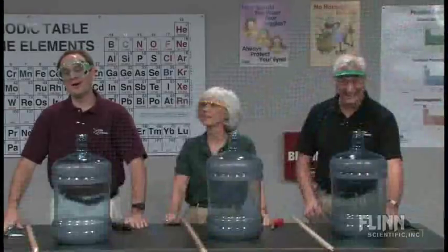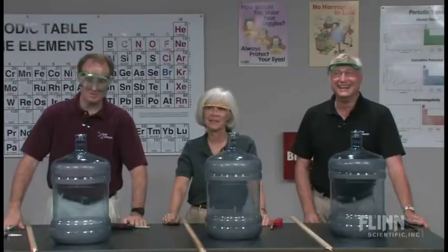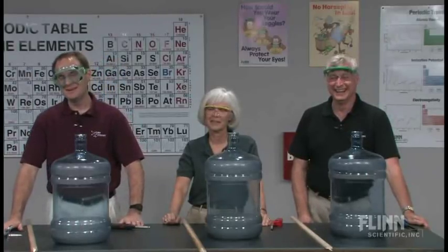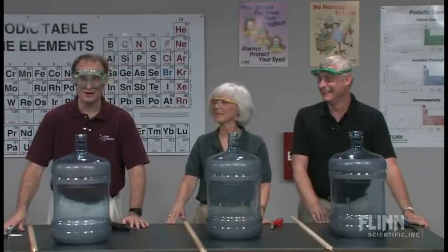It's important always to make sure that you follow the proper safety precautions when you perform this demonstration, because certainly you don't want this to be your last demonstration that you do.